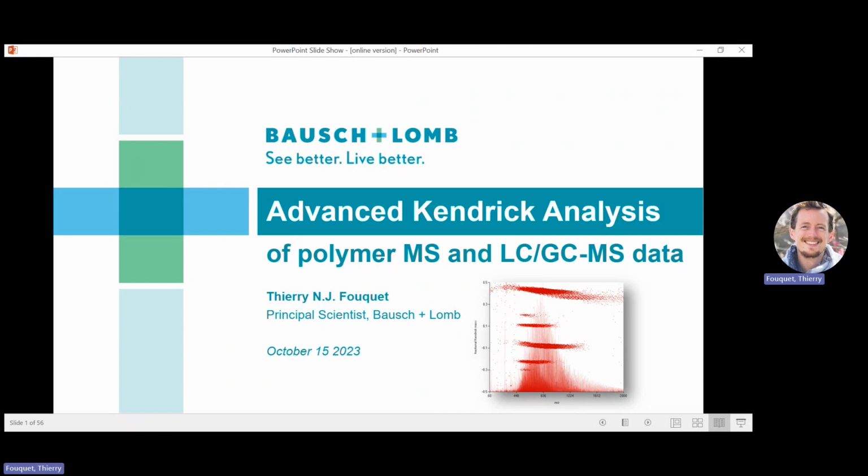As you may know, I was supposed to perform a live demonstration of this Kendrick analysis during our annual workshop at the ASMS last June, but we had so many things to go over, we had to postpone this demonstration. And I said later that I would organize one of our informal virtual online meetings doing that demonstration, but you know how it is. We all are busy, and I am busy, and I didn't have enough time to prepare for that presentation.